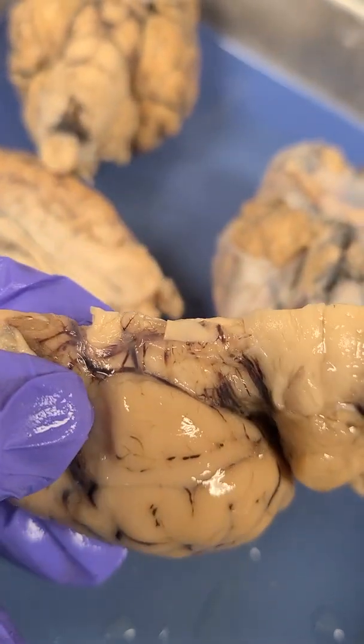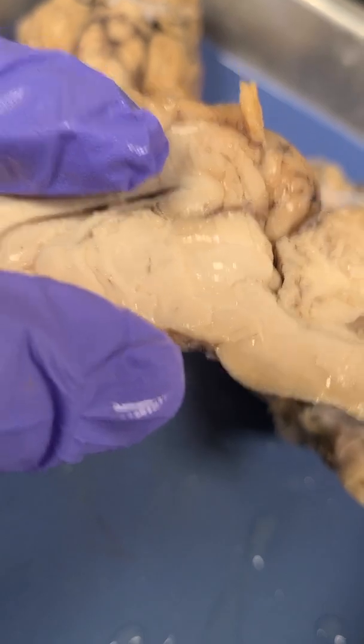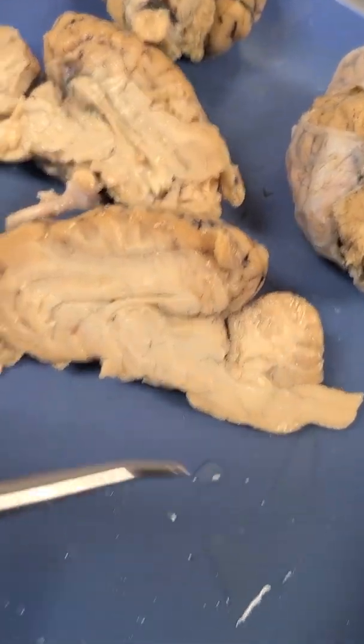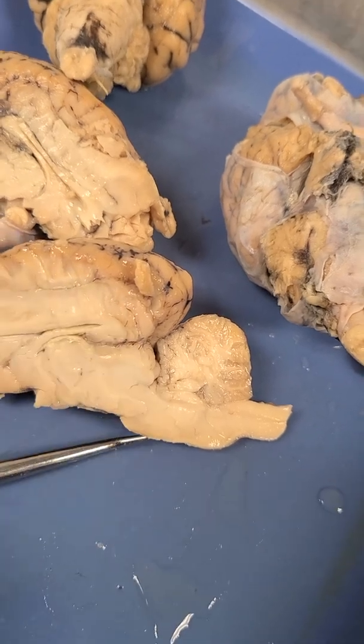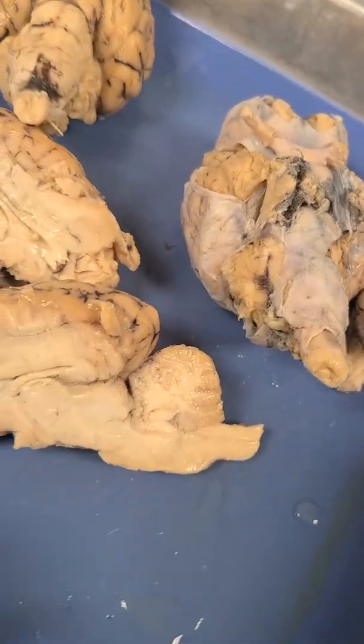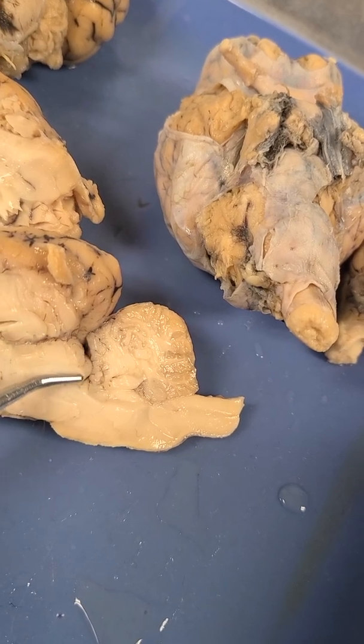So you can flip it over and see that was the mammillary body. And then behind this mammillary body, in this area right here, is the side of the cerebral peduncles. And then up here are the superior and the inferior colliculi.